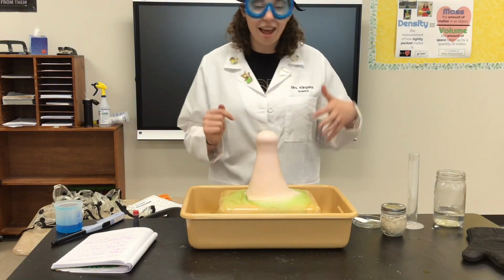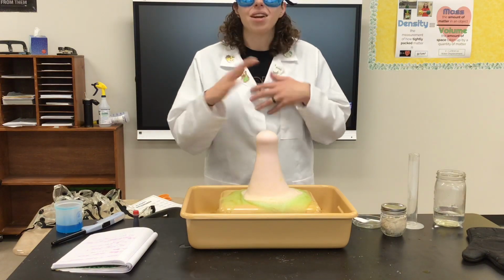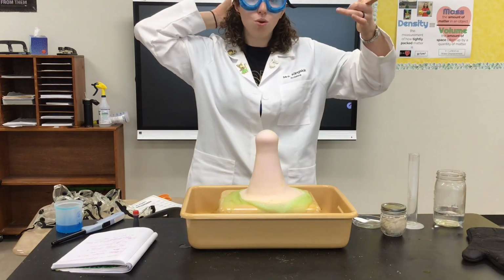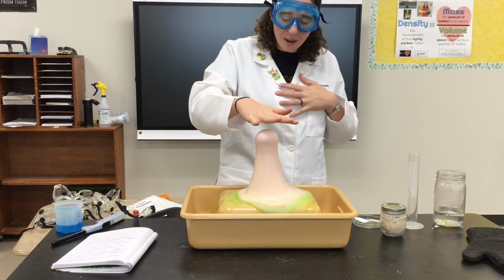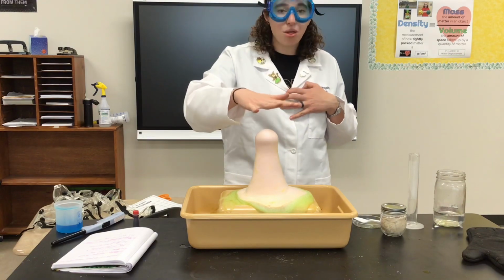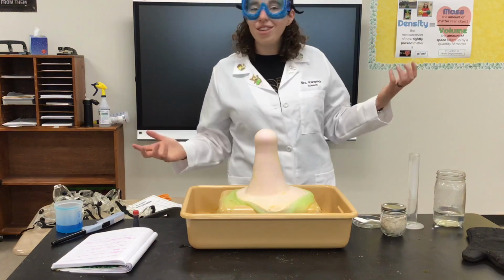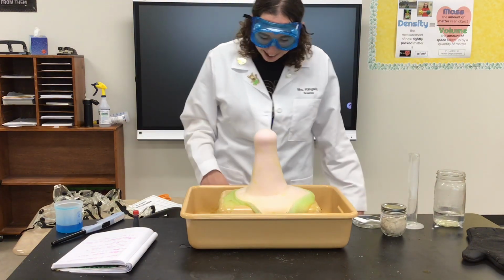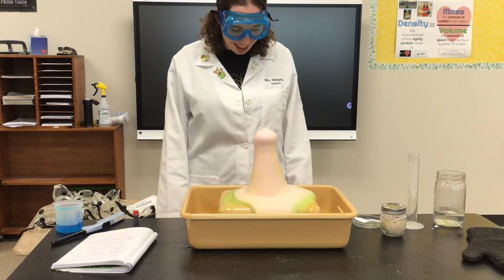There is actually an exothermic change. Exothermic means that heat is being given off. The one we just saw where it got cooler, that's endothermic. It got colder. So we have, ooh, it's hot. That is an exothermic change because heat is being produced. So all of these are signs of a chemical change. Isn't that so cool? Oh, it looks so cool. And that's elephant toothpaste.